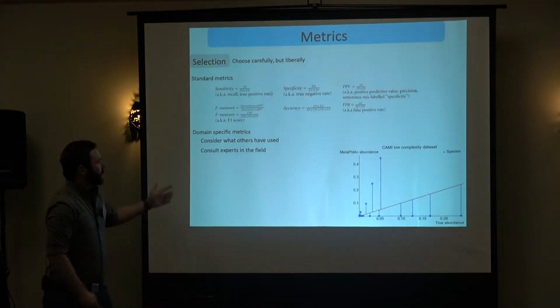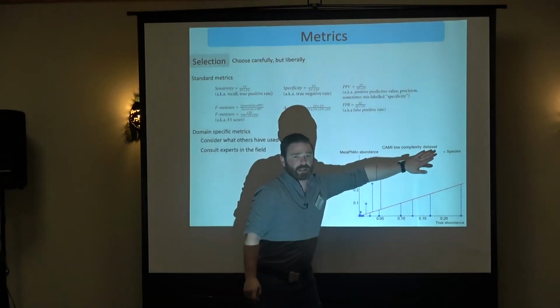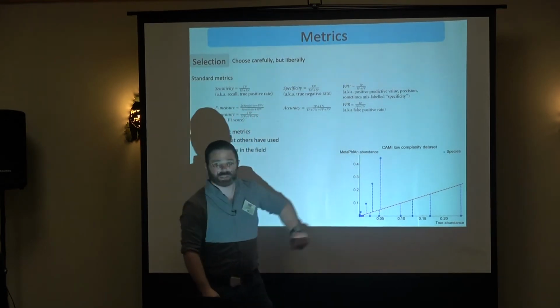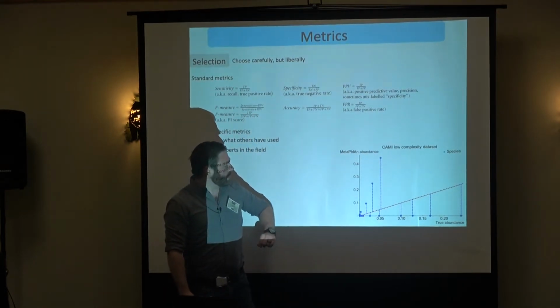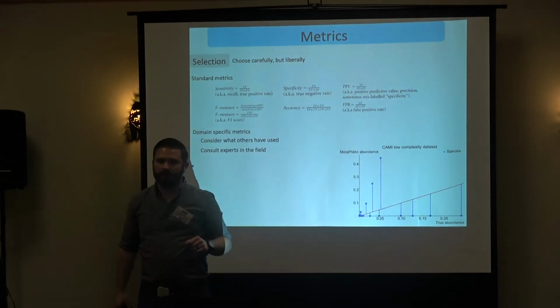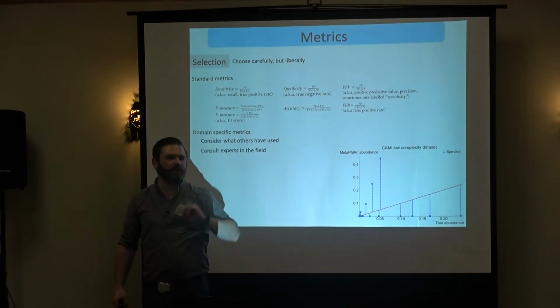For example, in this one, if you look at the output at the species level for MetaPhlAn, where each one of these blue dots represents a species, you'll notice that they have no false positives. Oh, this is great. No false positives. Your specificity, wonderful.